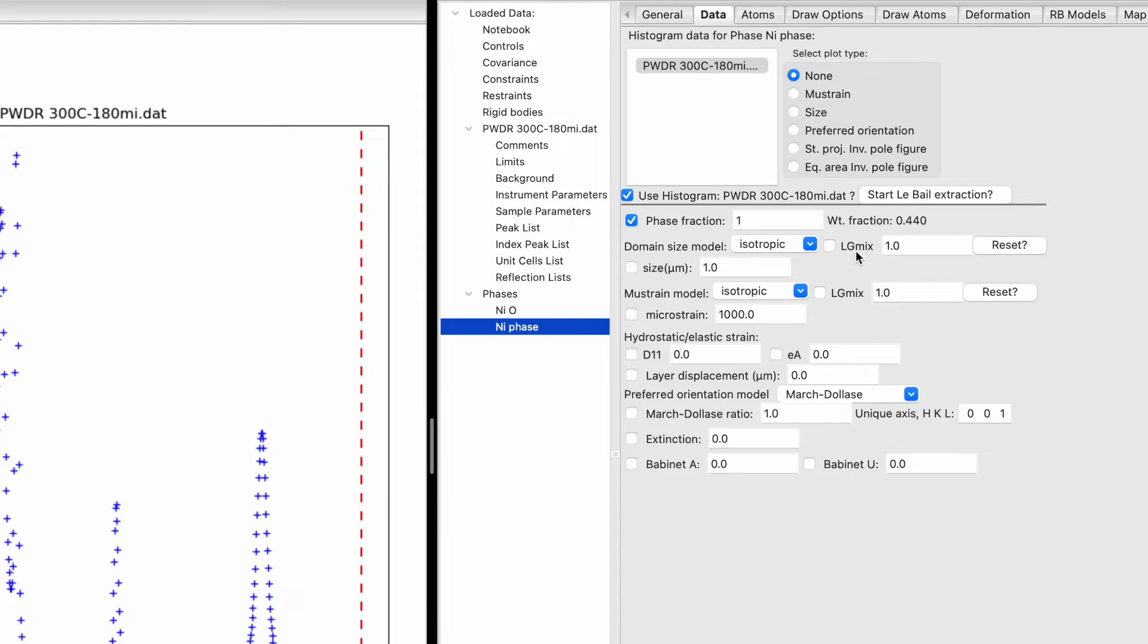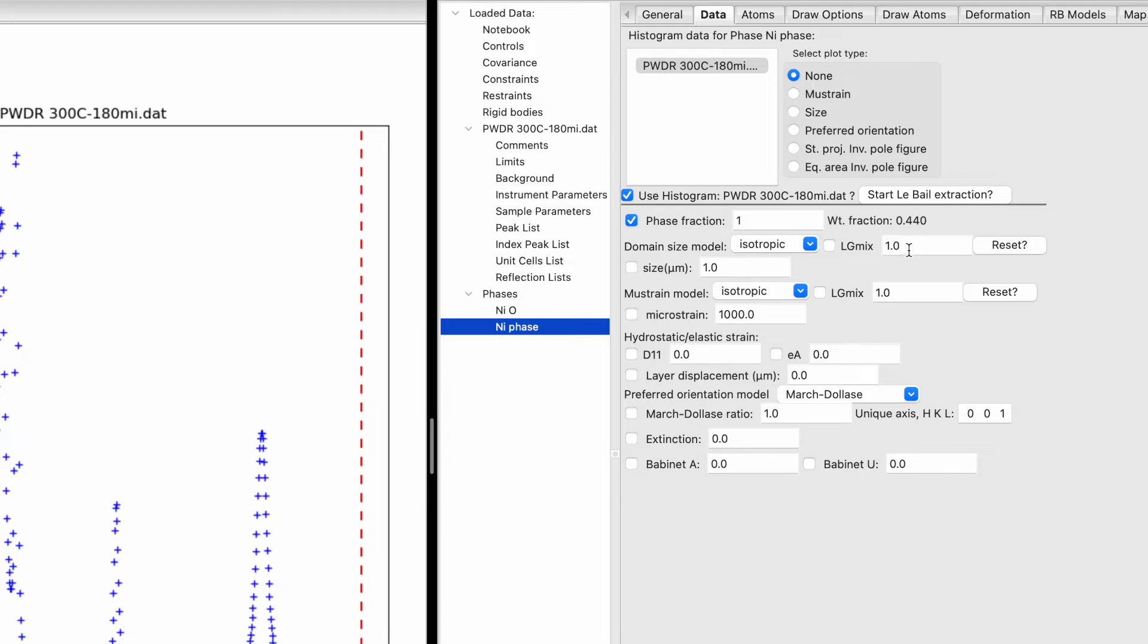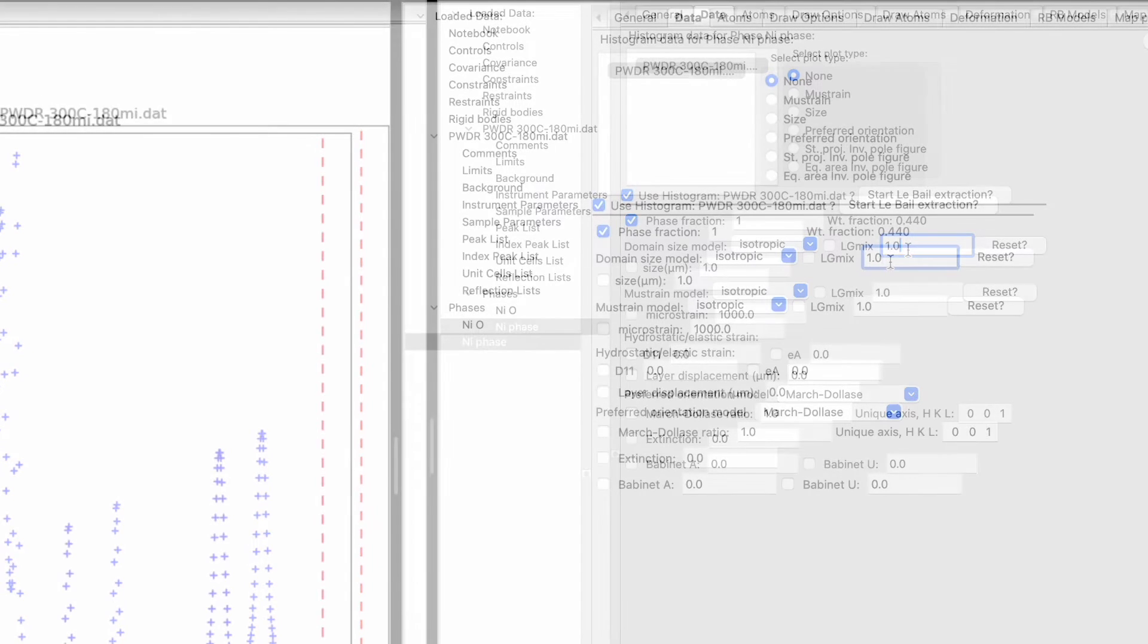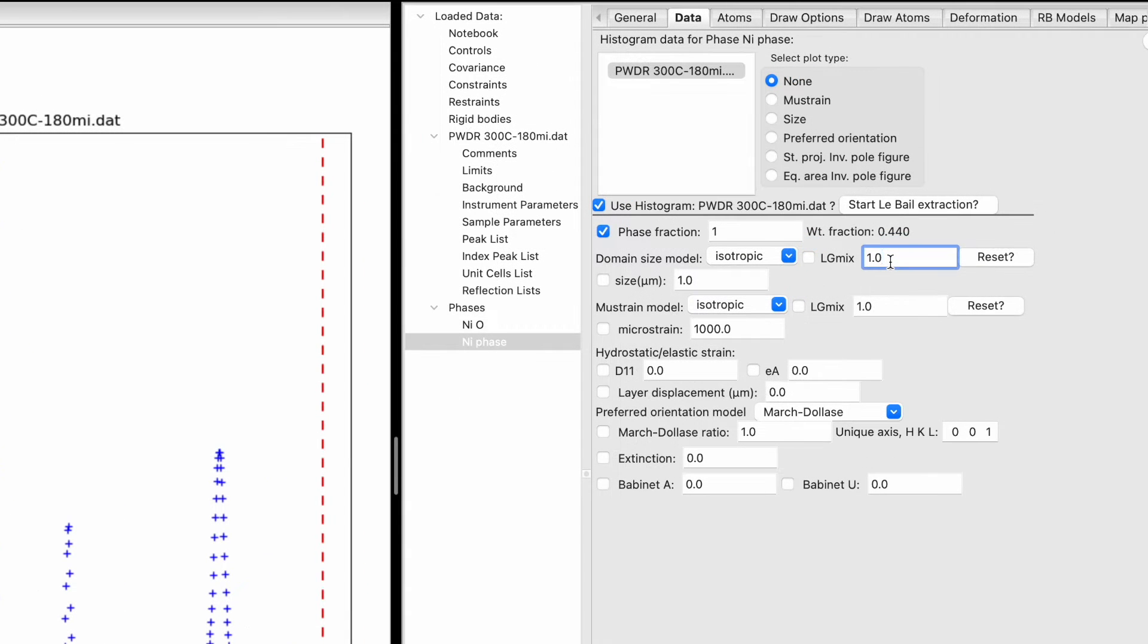The LG mix parameter represents the Lorentzian and Gaussian mix function. Peaks can be a mix of both, purely Lorentzian, or purely Gaussian. This coefficient ranges from 0 (Lorentzian) to 1 (Gaussian). Ensure this value doesn't exceed 1 during refinement.